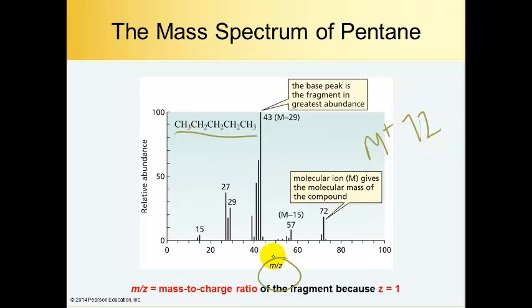Let's talk about the m/z. So we're talking about the x-axis units. M is mass and Z is charge, so it's the mass to charge ratio. Down in this area of the spectra, we're definitely talking about a single charge. So then we're talking about the full mass per the single charge, and this is the molecular weight of the molecule that we're looking at, 72.